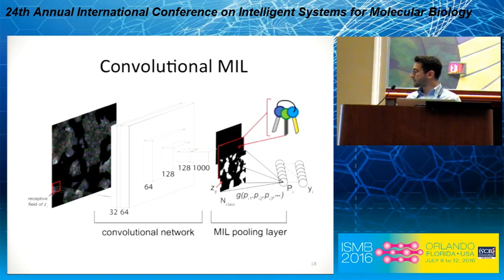And we also design the network such that an element in a class-specific feature map has a receptive field approximately the size of one cell, so that each pixel here more or less represents whether that area has that label or not. In the experiments, we tried different pooling functions to aggregate these probabilities, and then we have a fully connected layer to finally map these probabilities to the labels in the image.